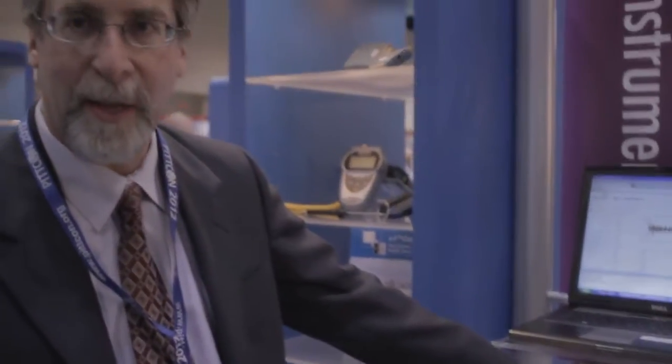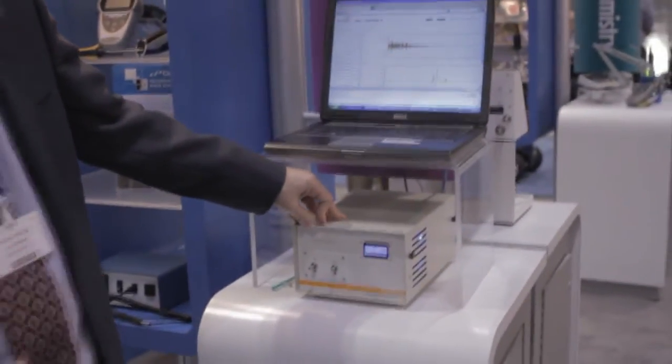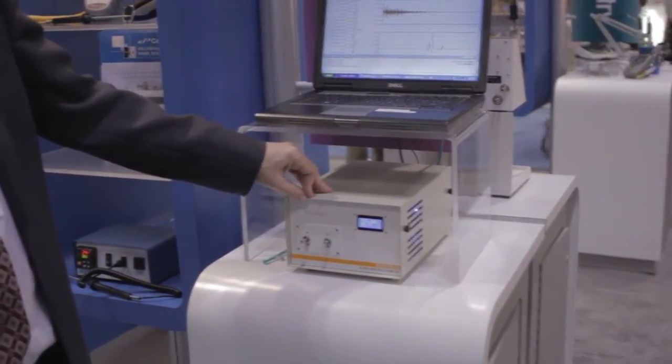The box doesn't have any controls on the front panel, but on the back side there's an ethernet connection. So it goes right on to the local network in your lab. And then you control the spectrometer using a web browser on any computer that's on your network.